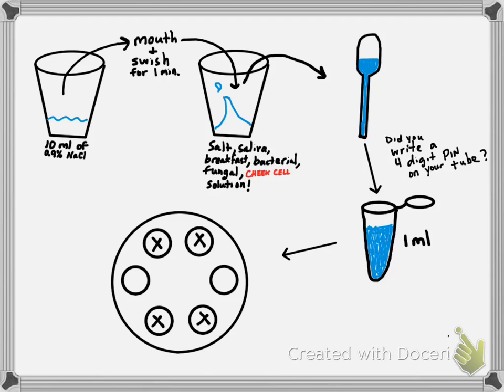If you are a lone spinner, you can make a blank tube, and this is a tube with the same volume of water in it, and then you have at least 2 tubes to put in the rotor. And make sure long hair and jewelry are clear of the centrifuge before you start spinning. Once loaded, you'll spin for 1 minute at the highest speed.